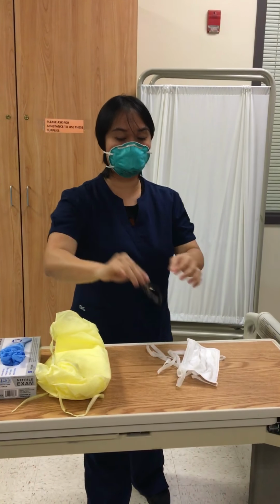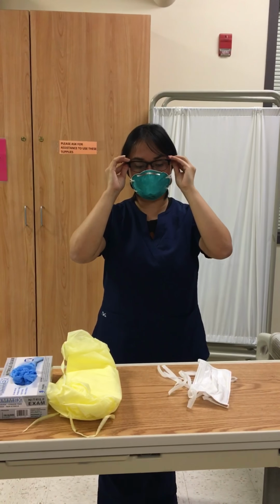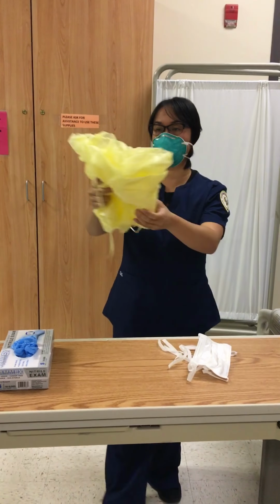After that, let's pretend this is a protective eyewear. So I'll put on the protective eyewear. And then the gown. So for the gown, make sure it doesn't touch the floor. You tie it around the neck, and the waist.